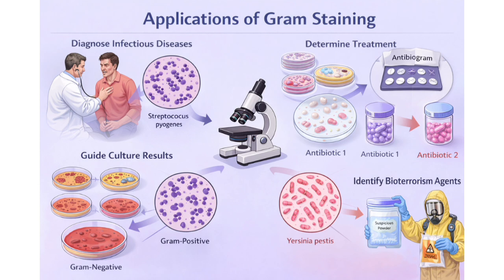It will help in the study of bacterial morphology, the shape of the bacteria, whether it is coccus shaped, bacillus shaped, or spiral, or the arrangement, whether it is in the form of clusters, chains, or pairs. And it is also used in research and training purposes. It is widely used in microbiology laboratories for studying bacterial structure and demonstrating staining techniques to train students.